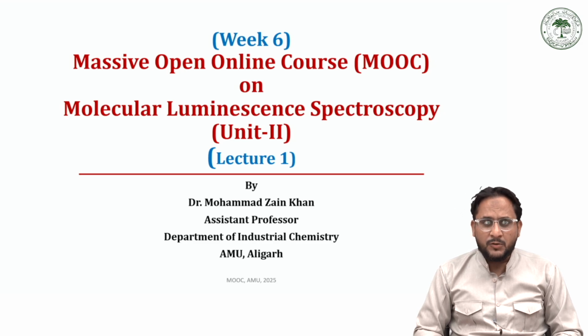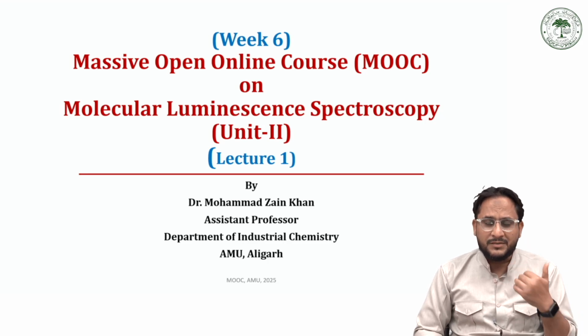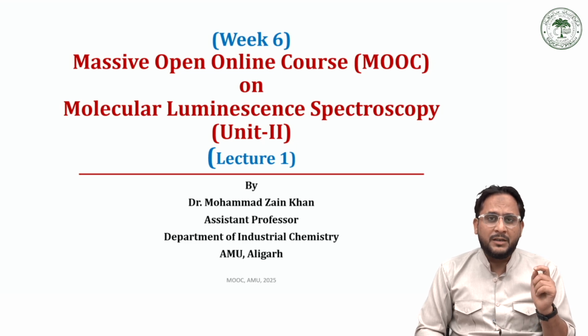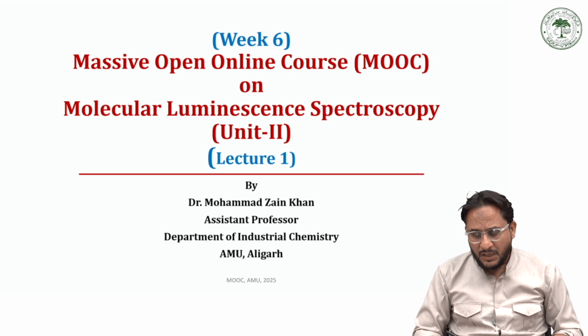In addition, I also explained the flow sheet of a spectrophotometer: how the light source creates the light radiation, and that radiation passes through the monochromator into the sample tube, then passes to the second monochromator. The second one is called the emission monochromator, while the first monochromator is called the excitation monochromator, and finally the light falls on the photodetector, followed by the amplifier and the output device.